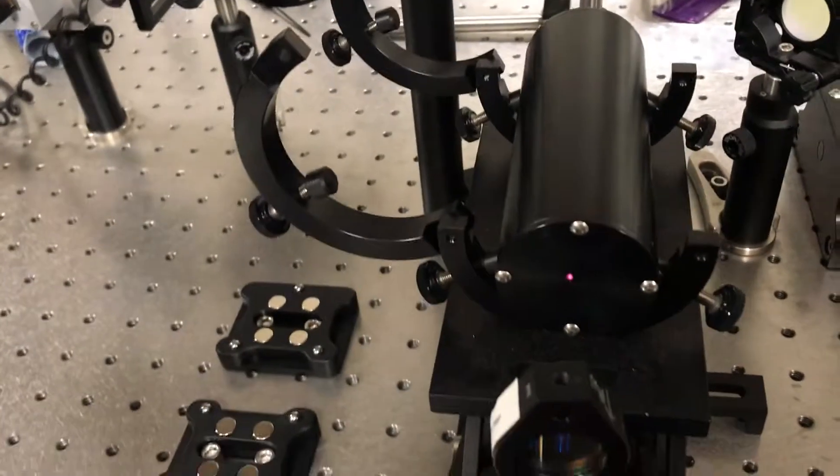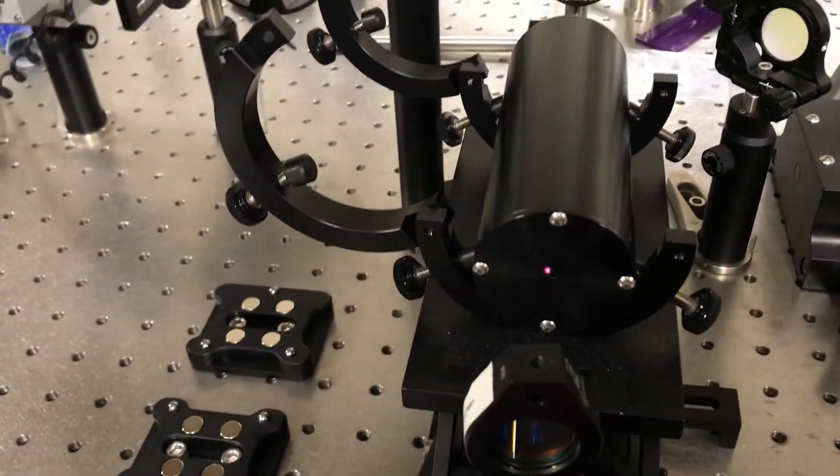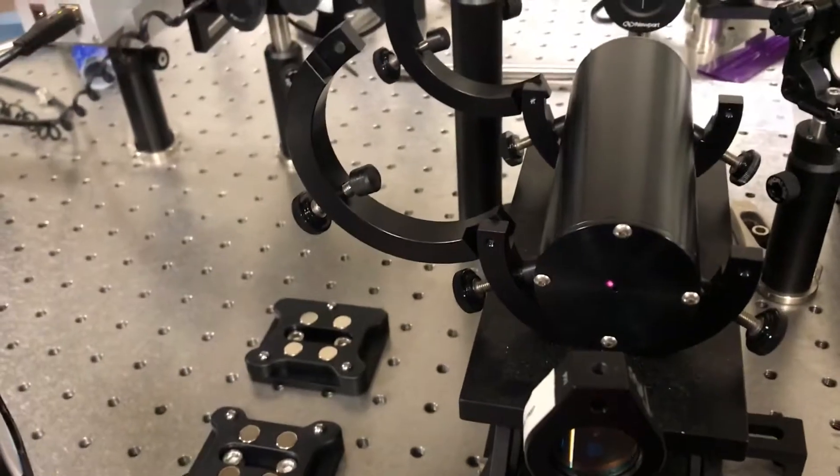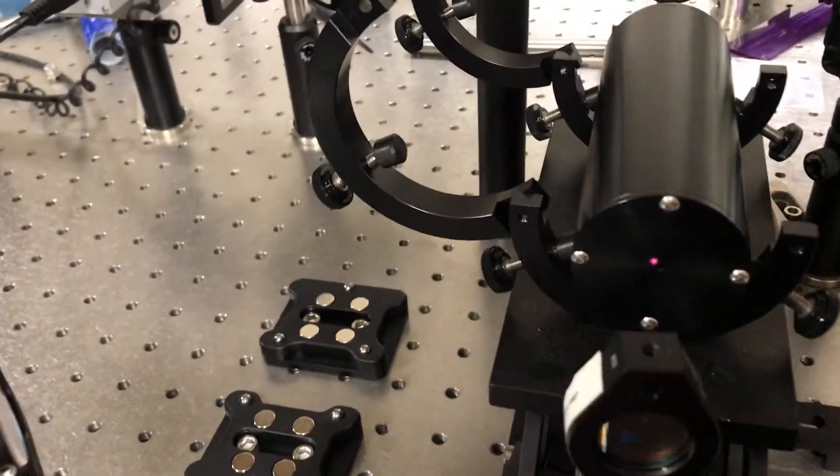So the best thing to do is to actually move the electro-optic modulator or the alignment tool for the electro-optic modulator until things go through the hole.